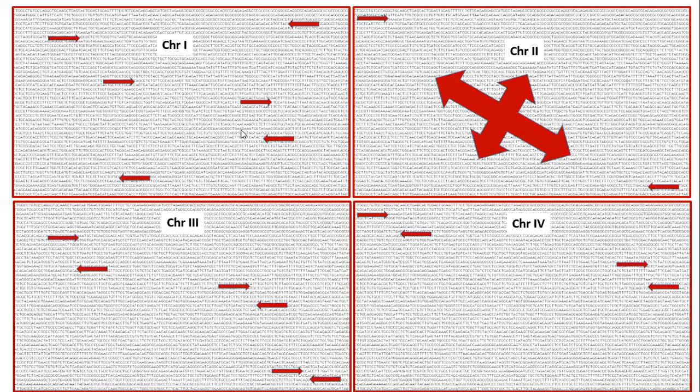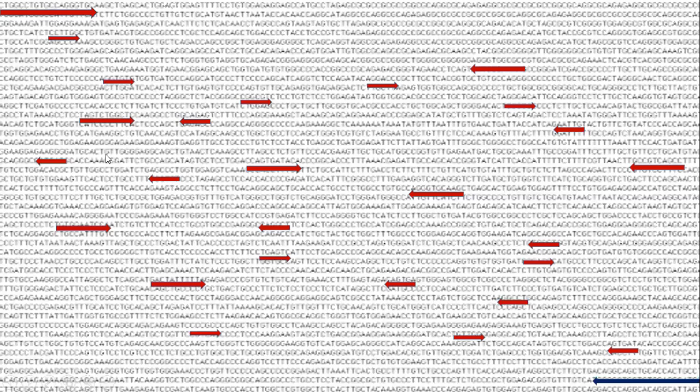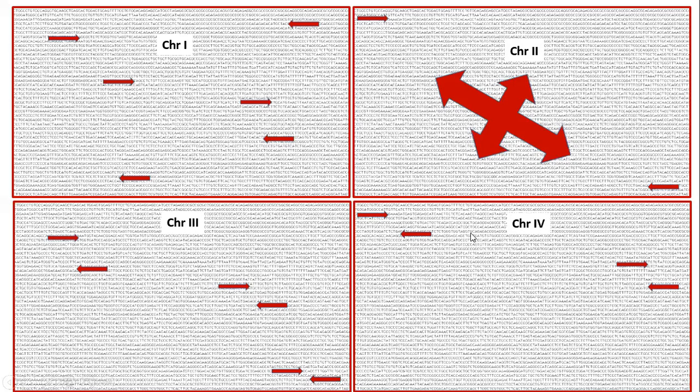What will happen in the PCR reaction? Let's take an example here. So this is one genome, or let's say chromosome 1 or chromosome X. The same primer, randomly I picked ATGCs. I have chromosome 1, 2, 3 and 4 here. I used the same primer and I allowed the primer to randomly anneal in the PCR reaction, go into different portions of chromosome 1, 2, 3 and 4. So if I do that reaction of annealing, given the specificity, given the randomness of the genome, the primers, both forward and reverse, can bind randomly in different locations of the genome or different chromosomes.